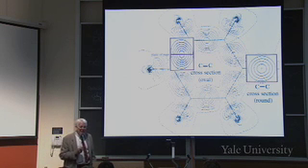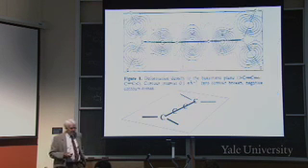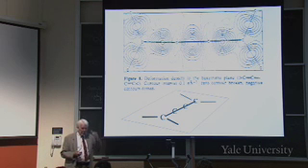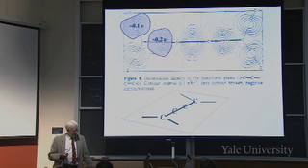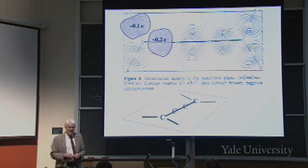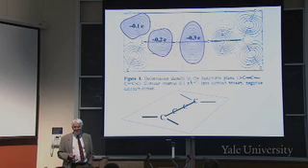Because they're partially made up of these p orbitals that point in and out of the ring, that distorts it from being round. Okay, now let's look at the double bonds that are in the middle of this molecule. First, that one, we've already seen that bond before, that was 0.1, had a round cross-section. But let's look at one of the double bonds. Not too surprisingly, it has more electron deformation density in it, 0.2, right? And the one in the middle actually has 0.3.